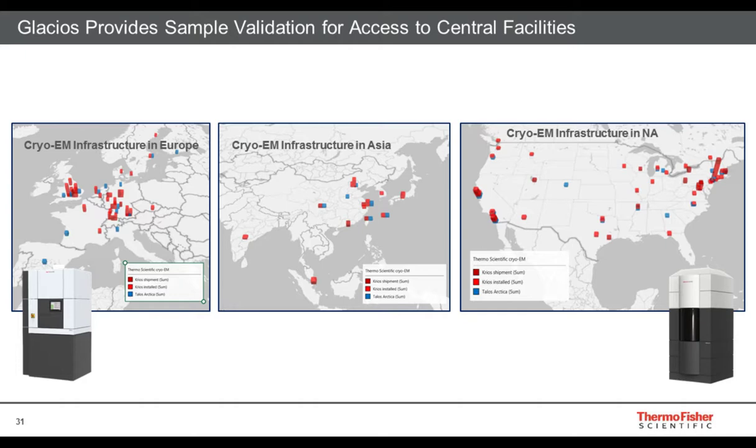The entire workflow is covered at those Cryo-EM schools, from sample preparation all the way up to data reconstruction. So that's what you can do in order to get educated, and the advice we can give to start with a Cryo-EM experiment and adventure.